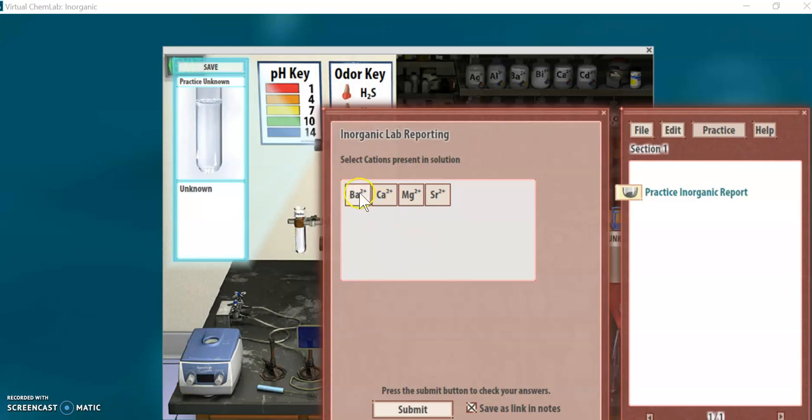Select the ions that you think are present in your unknown and click submit. I'm going to select all four ions, just to see what happens. I don't actually know what's in there. I'm going to hit submit. Ah, and see, it tells us what we got wrong and right.